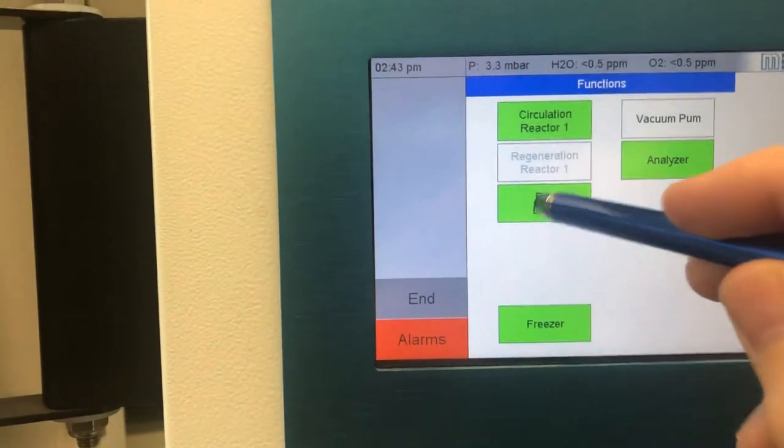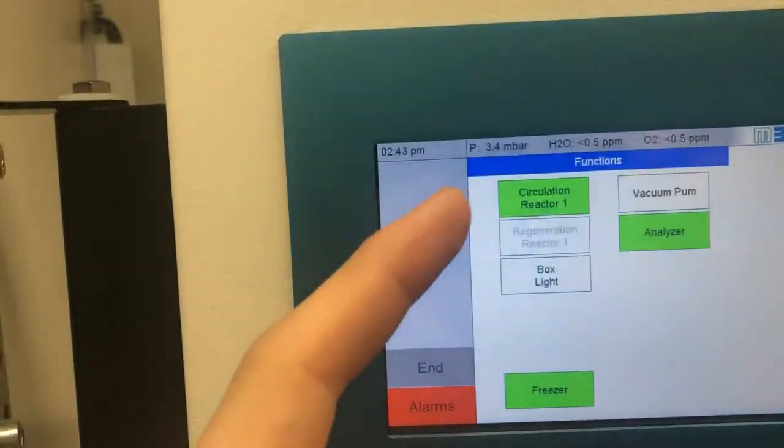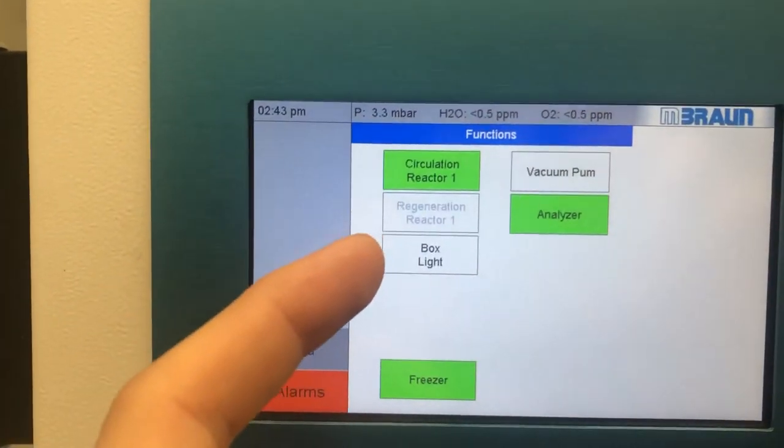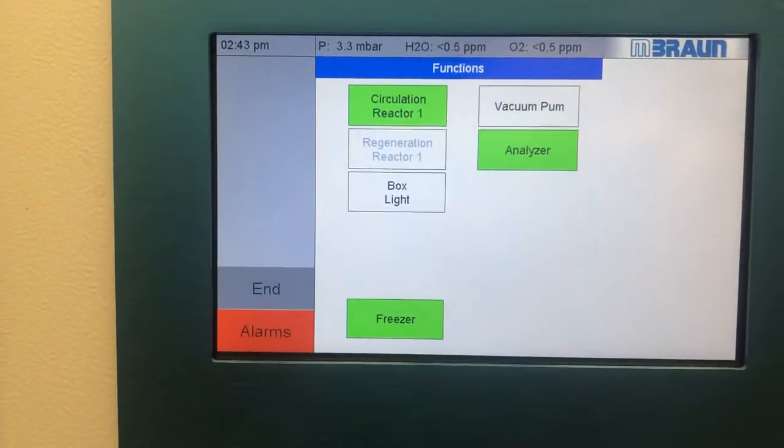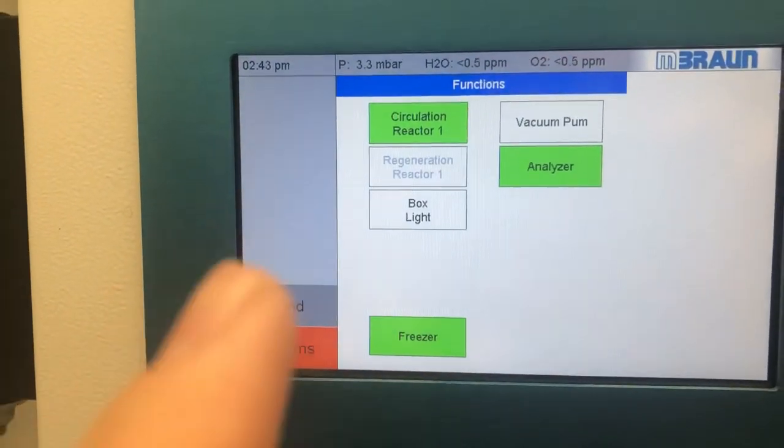We're going to turn off the box light as well. And now this is how we leave it. The circulation should always be on unless we are handling a liquid. Again, circulation is always turned on unless handling a liquid.